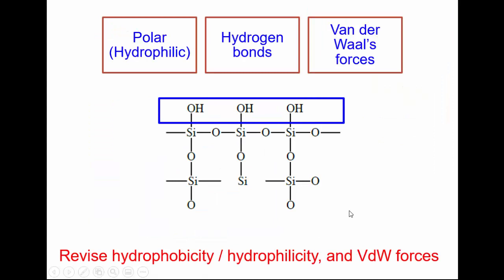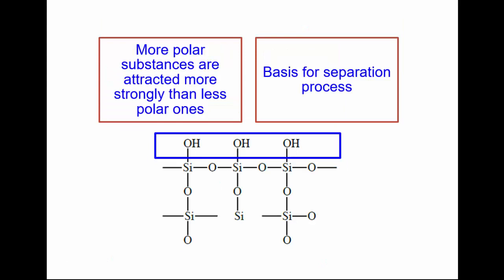Moving on. A number of forces listed here are potentially involved. You'll need to make sure you understand hydrophobicity, hydrophilicity, and polarity, and van der Waals forces, a bit less the latter, before we proceed, and you may wish to stop the video and check your knowledge. Okay, I'm assuming you're back. The OH, which sticks up into the solvent, is a polar group, so will attract other polar molecules more strongly than non-polar ones. This is key and is the basis for the understanding of the separation processes involved here.